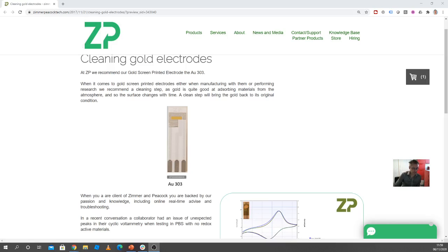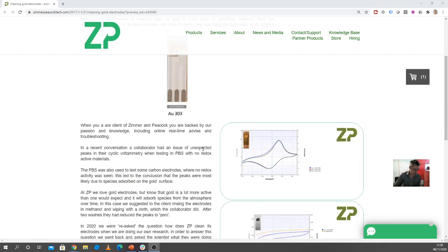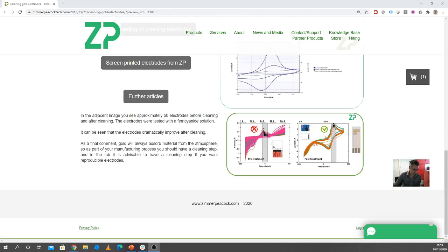Hi, so this is a quick video just to talk about cleaning gold electrodes. At Zimmer and Peacock, we're quite unusual in that we screen print and manufacture gold electrodes and actually test them to make sure that they're within our performance criteria.